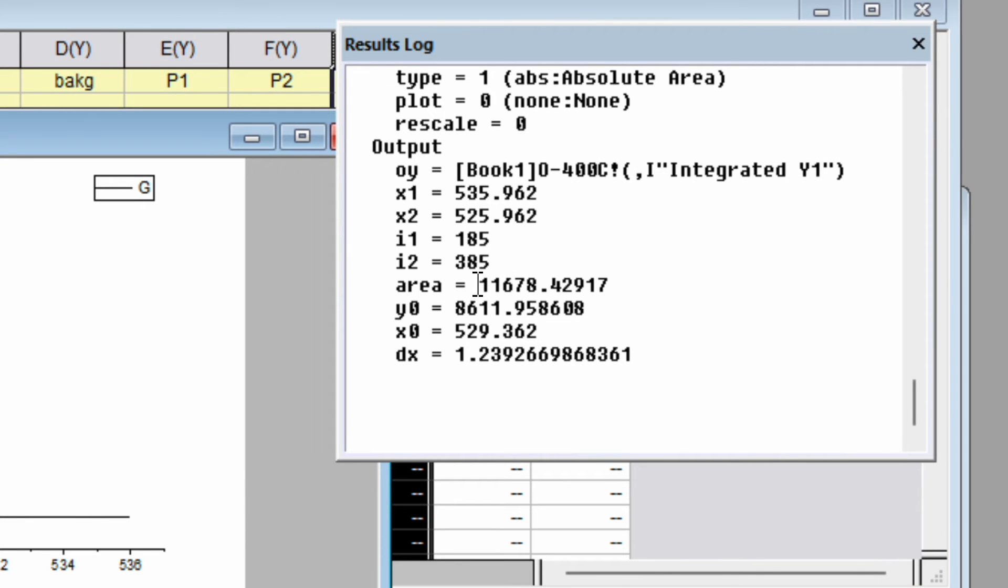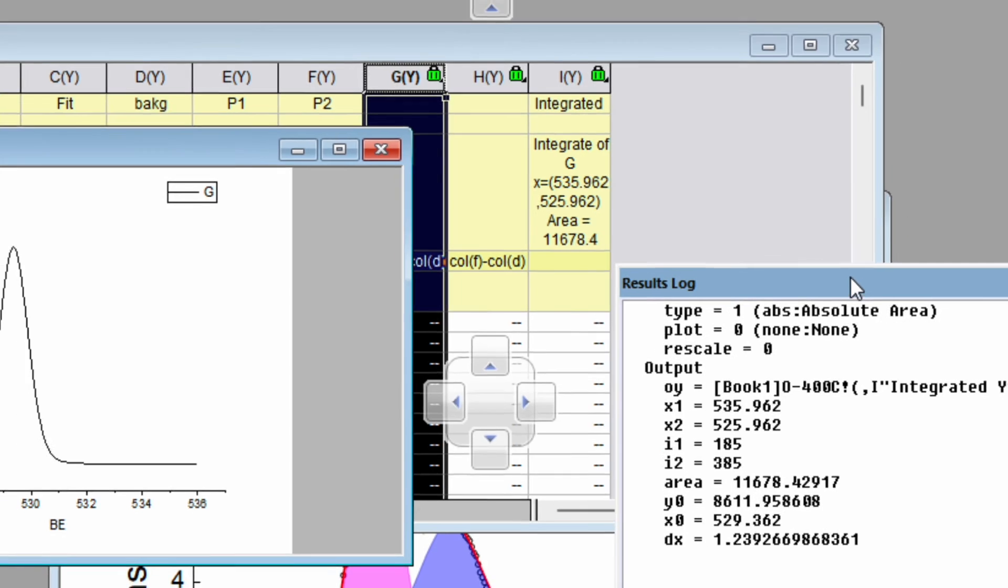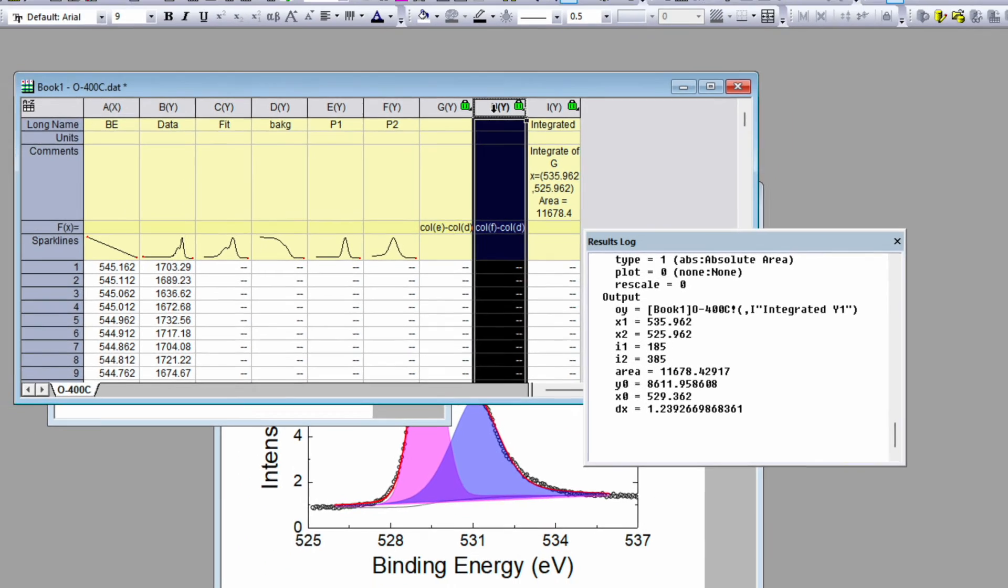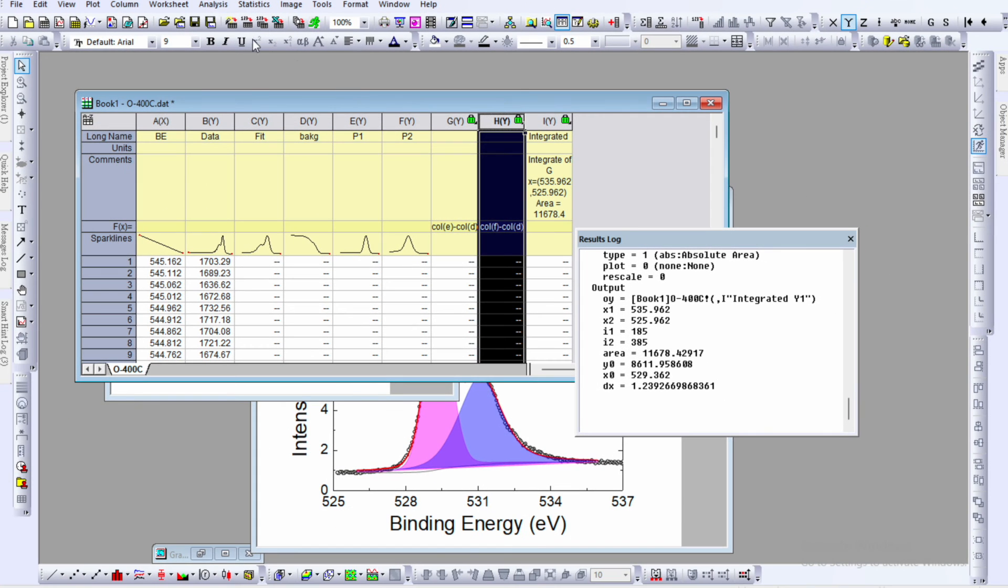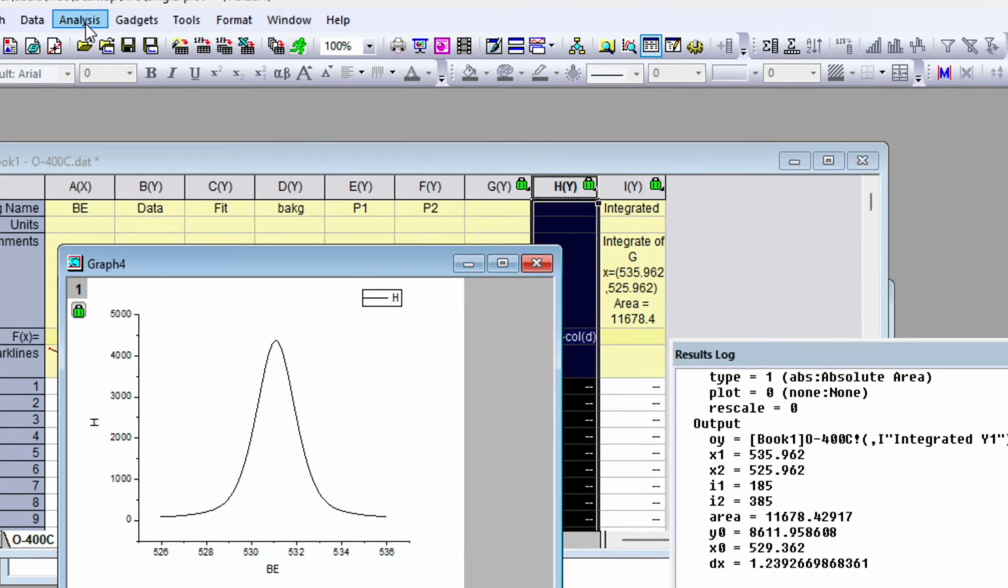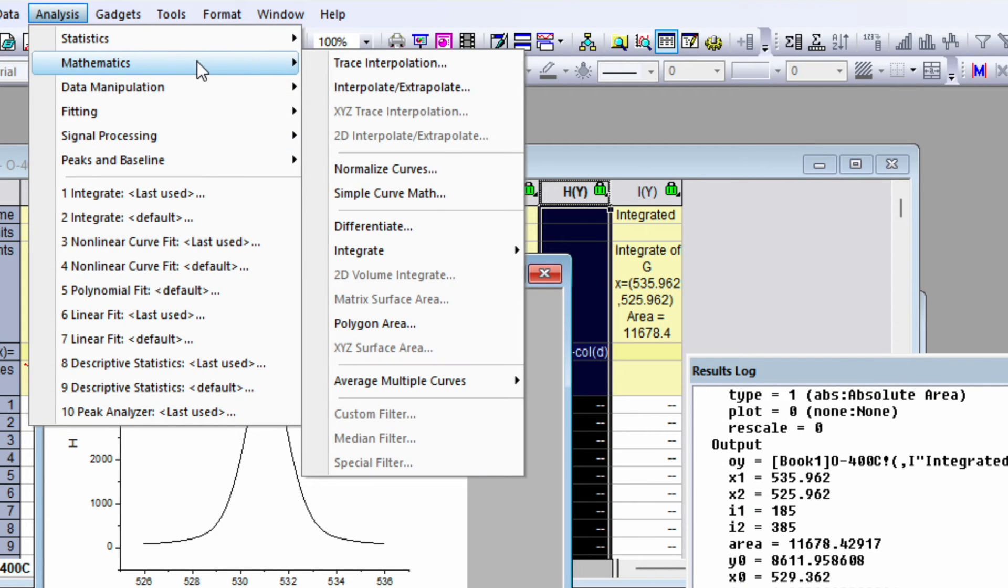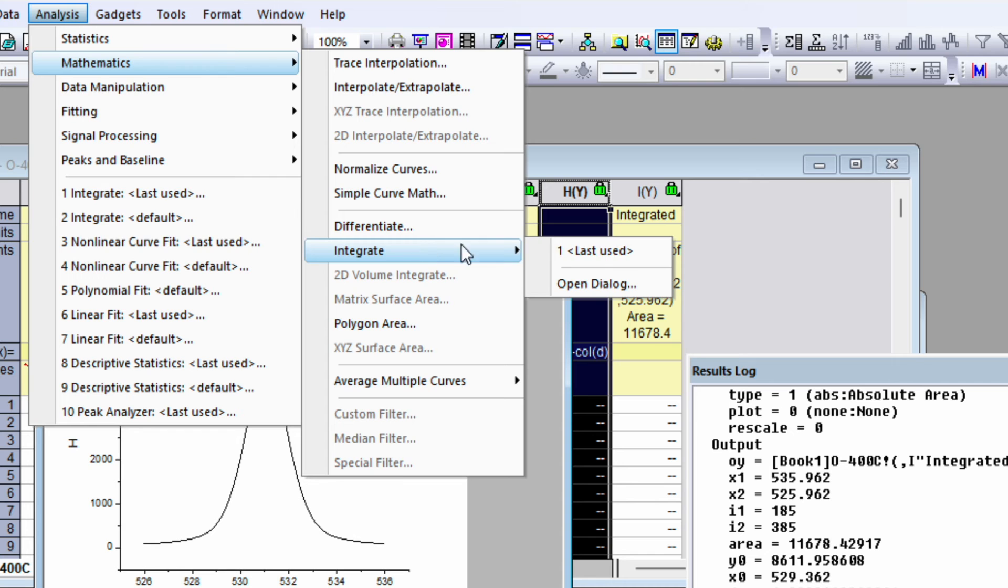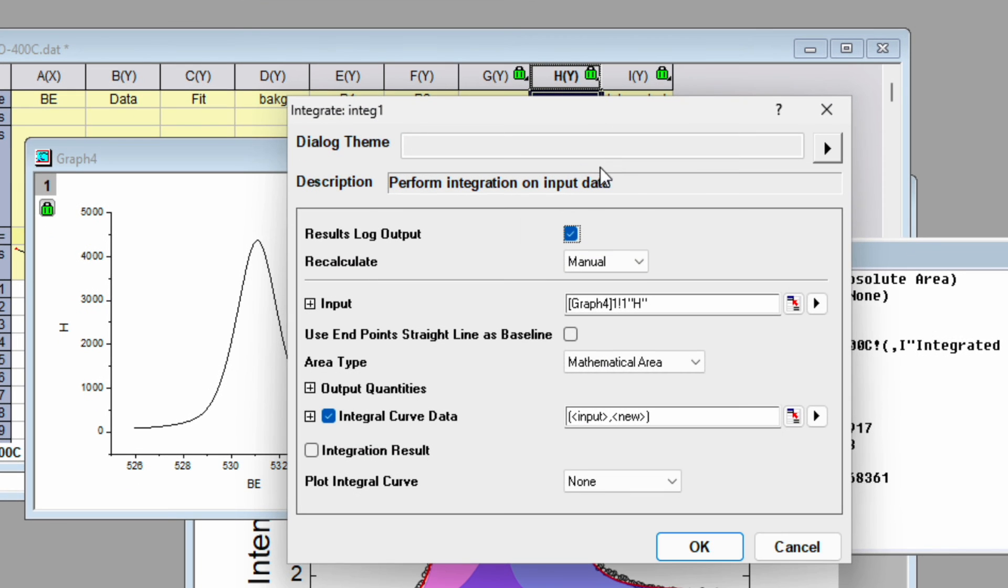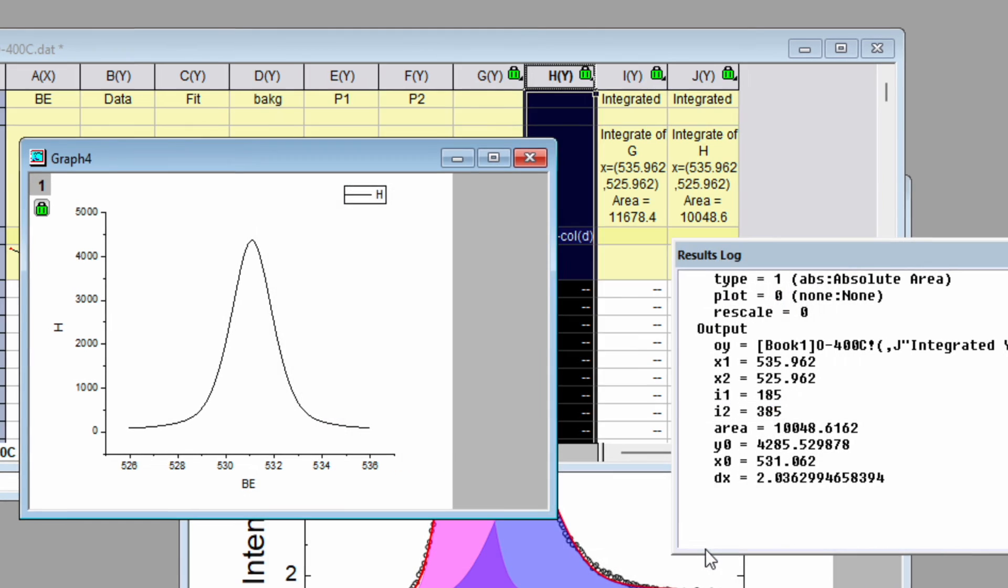Select the column line plot, go to Analysis, Mathematics, Integrate, Open Dialogue. Click use endpoint straight line and instead of mathematical area choose absolute area and click OK.